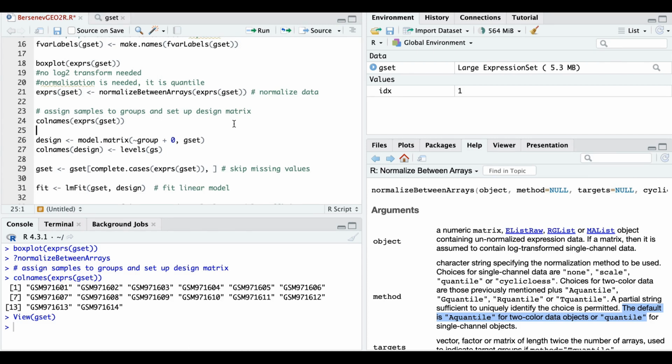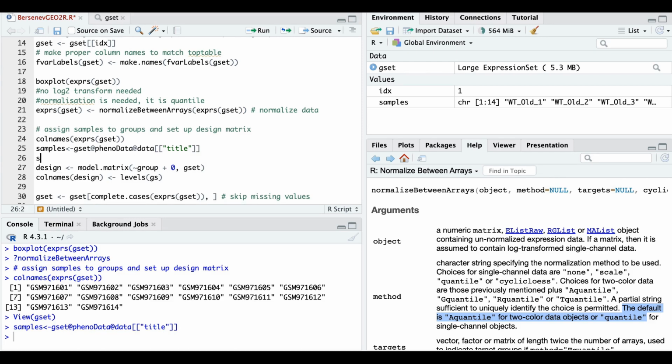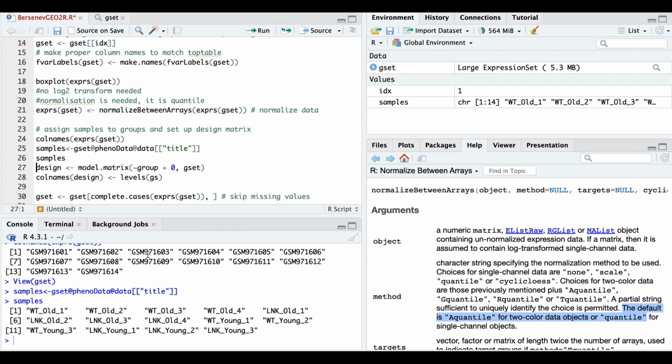which you copy and paste into a script and say samples are like this. And then if you go to samples, it gives you a good description of what is what.